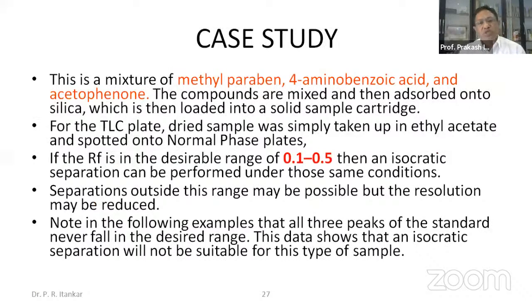So here I'm going to discuss a mixture of certain chemicals like methyl paraben, 4-aminobenzoic acid, and acetophenone. This is a standard kind of mixture, and the compounds are mixed and then adsorbed onto silica, which is then loaded into a solid sample cartridge. And for that matter, a TLC plate was prepared.